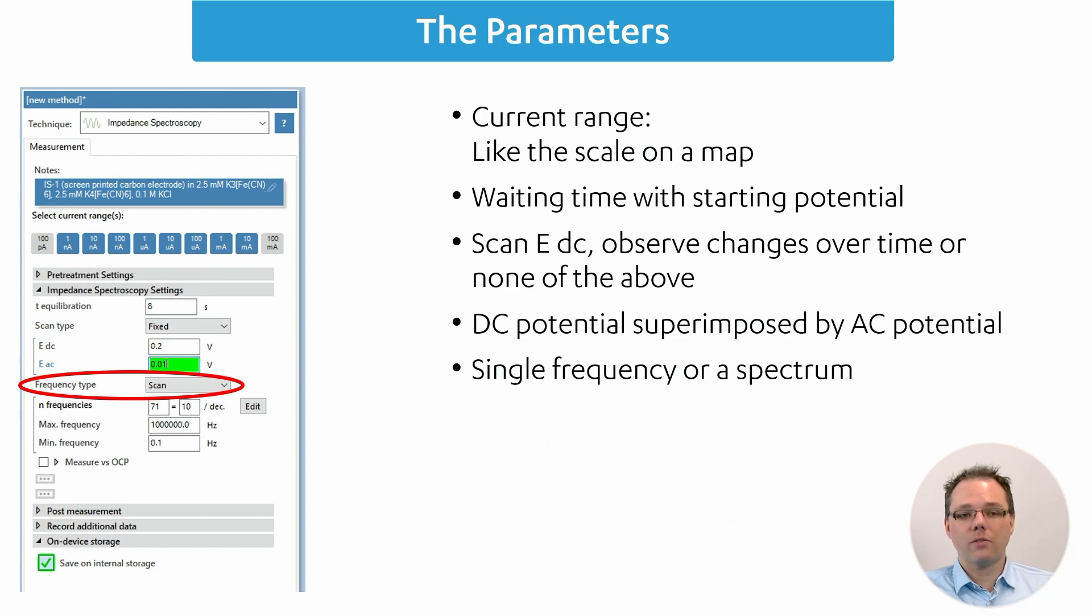Now I would like to turn to the frequency type. You can either record a spectrum and then you would have frequency type scan, or you can decide only to record at a single frequency. Maybe you just want to see how a corroding species is changing its impedance over time with a fixed single frequency.